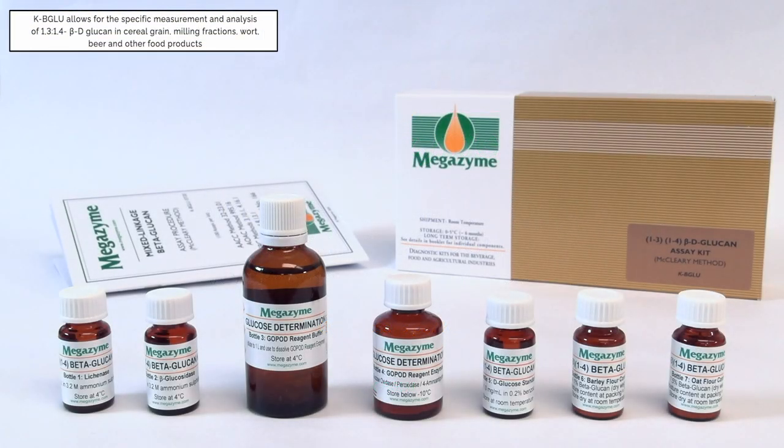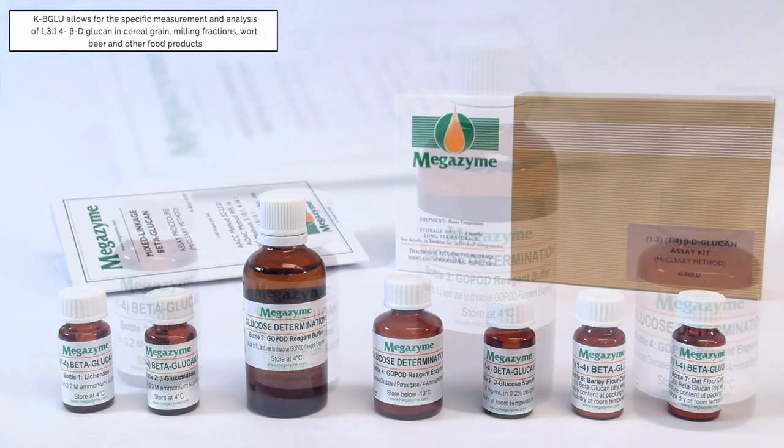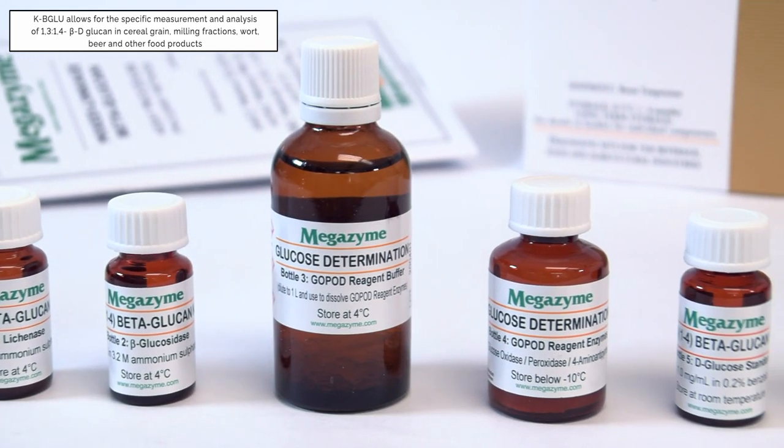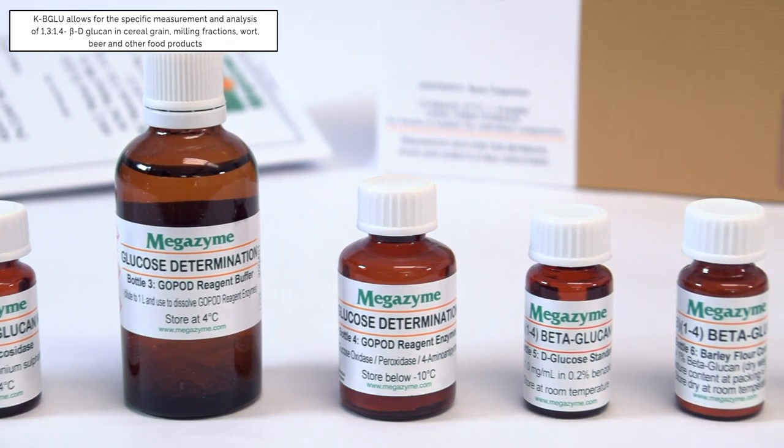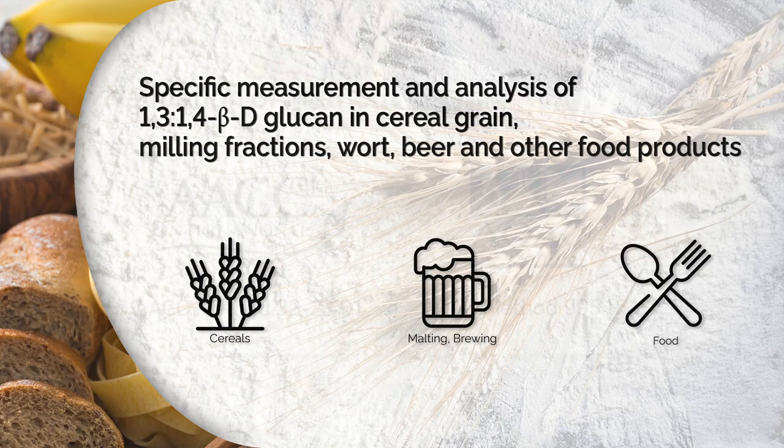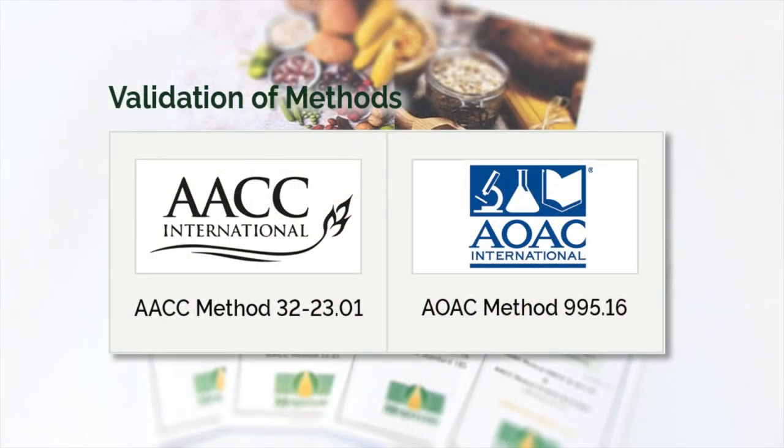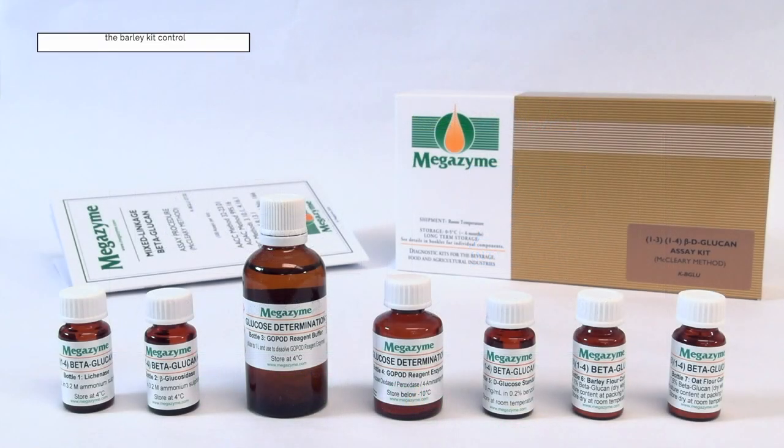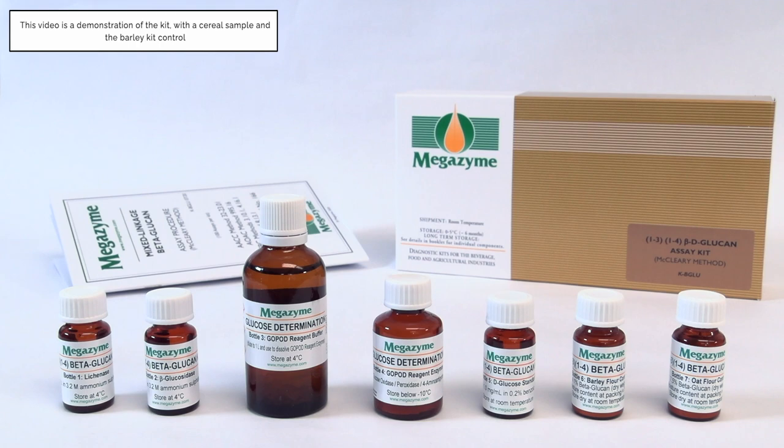This mixed linkage beta-glucan test kit, KBGLU, allows for the specific measurement and analysis of 1-3-1-4-beta-D-glucan in cereal grain, milling fractions, wort, beer and other food products. Following extensive inter-laboratory evaluation, this method was adopted as AOAC 995.16 and AACC method 32-23.01. This video tutorial will demonstrate the use of the kit with a cereal sample and the barley kit control.